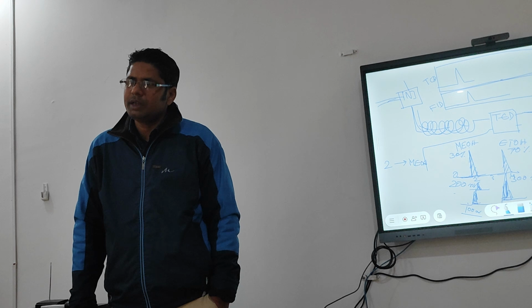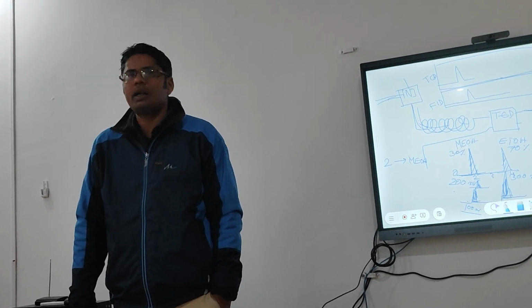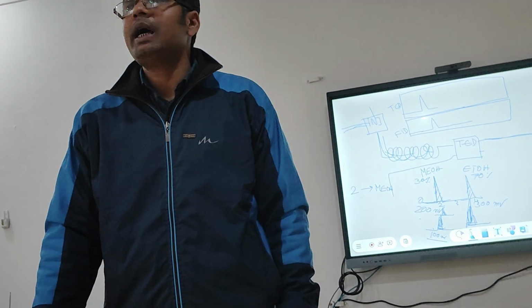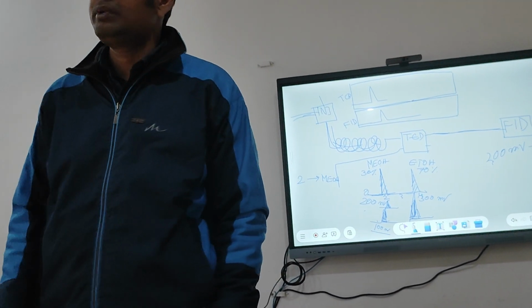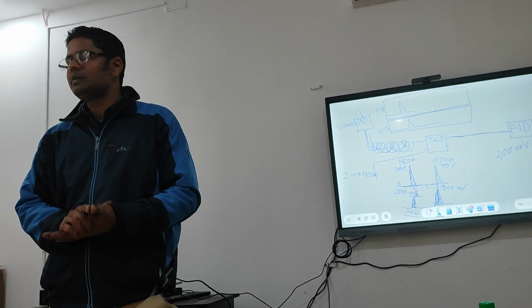That is called calibration. So inside calibration there are two processes. What are the processes? Retention time wise naming and area wise concentration fitting. These two processes, simply, you can do these things. All are software friendly, young generation. Yeah?